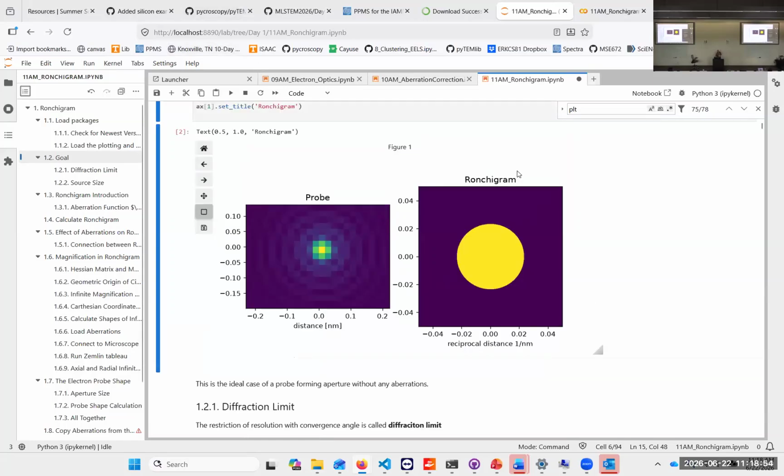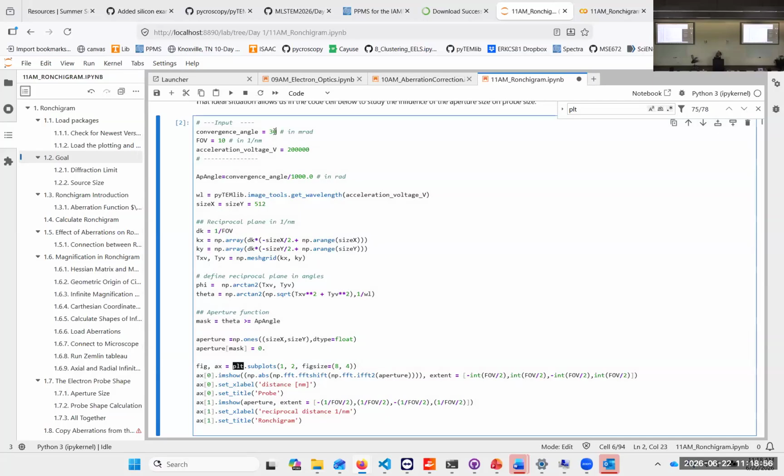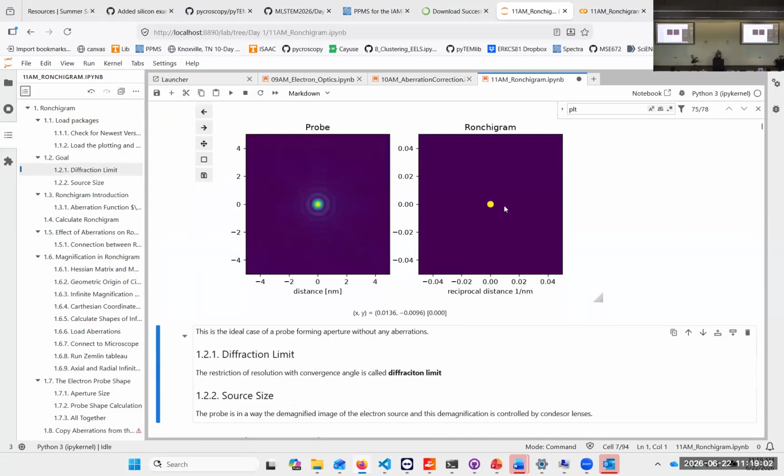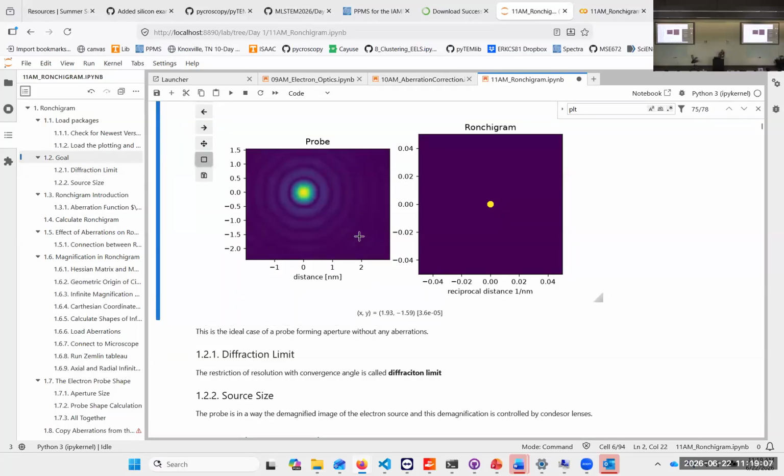Let's check it out. So if we have here a small aperture, you can see what happened. We get this from the Airy function, we actually get these reflections from the rim of the aperture, and they're very profound because we have a lot of rim compared to the inner part, right? So we have these oscillations here on the tail.